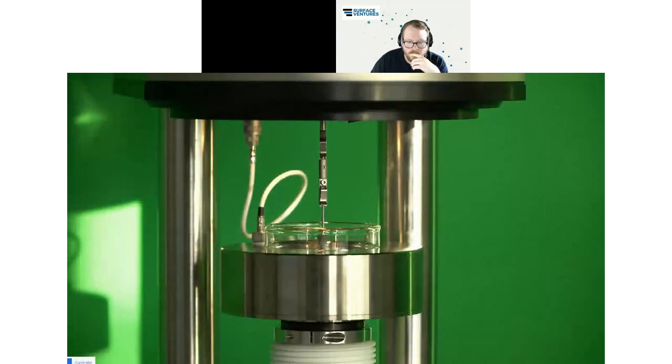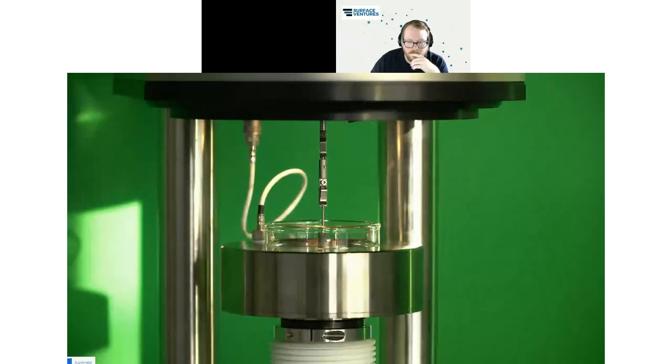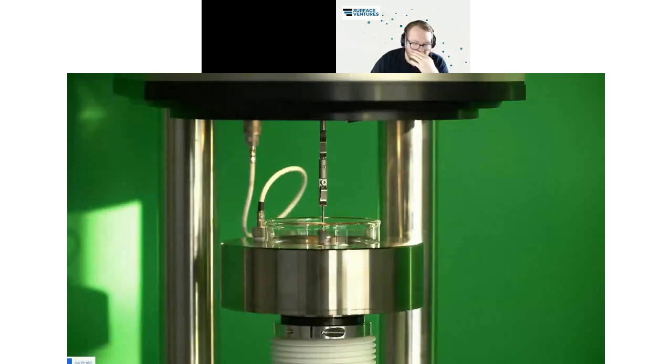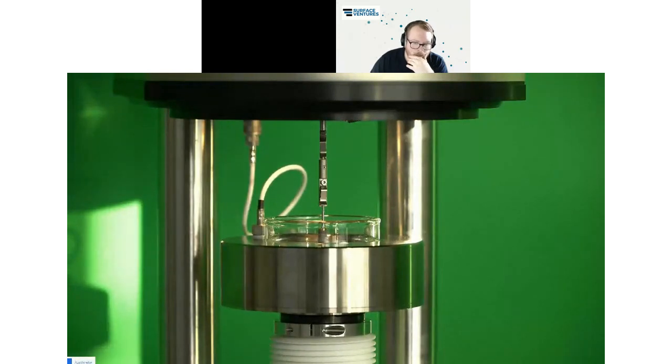If you look very closely, you see that the water level, the lamella, is moving up much, much faster than the implant itself. You see how it's going through the screw turns. I will show you a little video later that is a bit clearer.